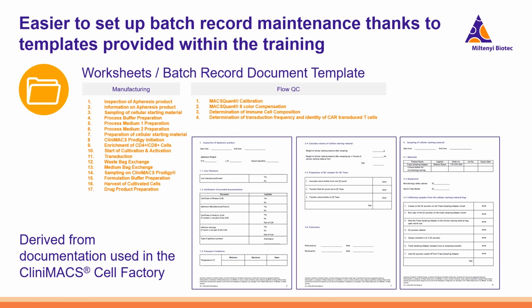Additionally, during the hands-on training, so during the cell manufacturing enabling training, the worksheets and batch record document templates are used because this is essentially a mock manufacturing process.